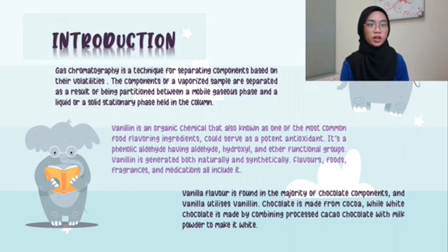Vanilla flavor is found in the majority of chocolate components, and vanilla utilizes vanillin. Chocolate is made from cocoa, while white chocolate is made by combining processed cocoa chocolate with milk powder to make it white.